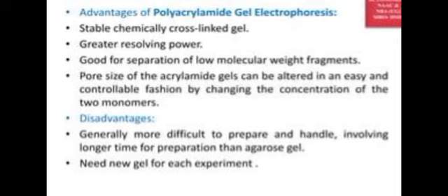And second, disadvantages of gel electrophoresis. First point, generally more difficult to prepare and handle, involving longer time for preparation than agarose. So this one is more difficult to prepare. Second point, need new gel for each experiment. Each experiment we need new gels. So these are the disadvantages in gel electrophoresis.